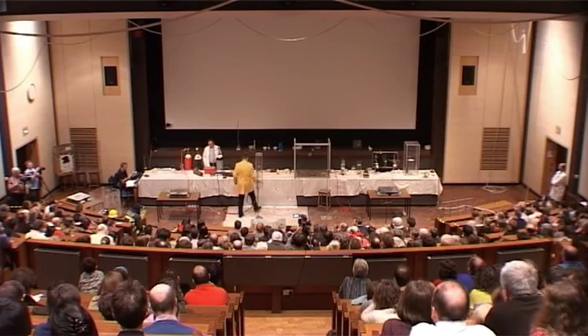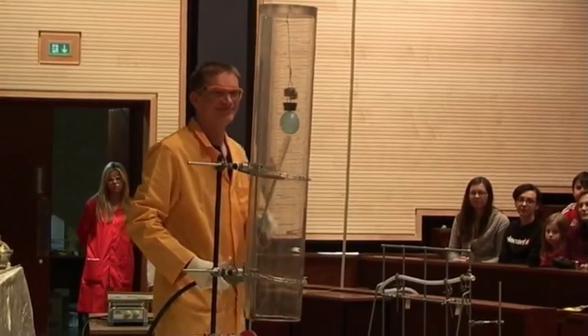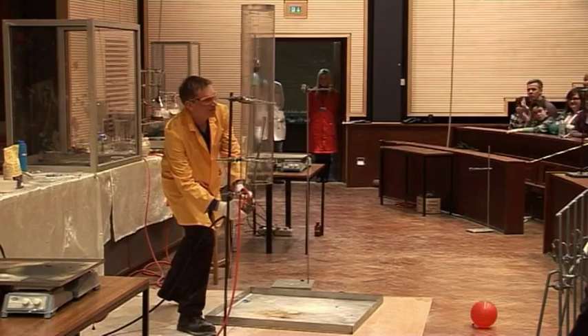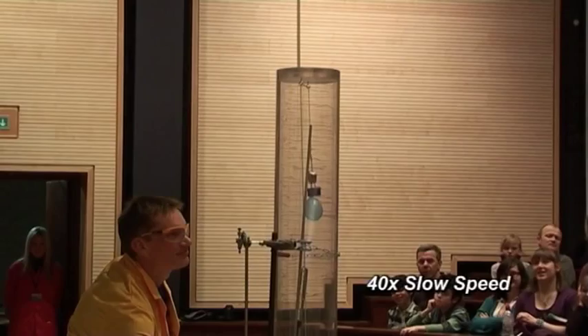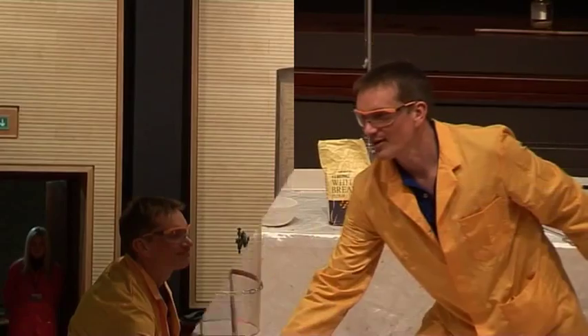All right. Ready? Good. Okay, so off. Clicker on. There we are. Fantastic.